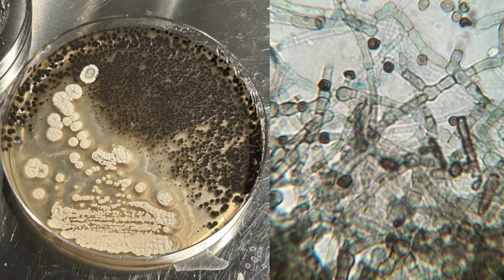Antibiotics are actually really good at this. As you can see on this contaminated Streptomyces plate, it outcompeted the fungi because the fungi was inhibited by the antifungals Streptomyces griseus also produces.